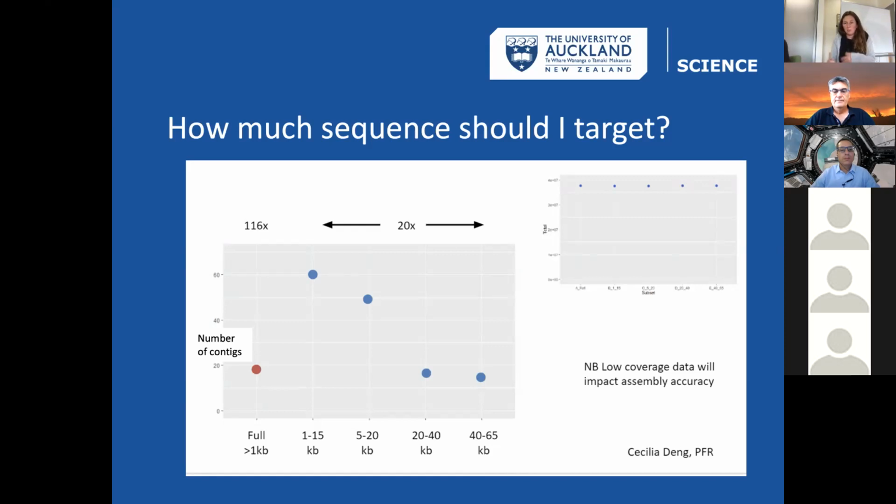And so you'll often not get a straight answer from us on how much sequencing depth you need to get the optimal assembly, because it's a more complicated, more nuanced question, I think, than a lot of us are used to with other technologies.